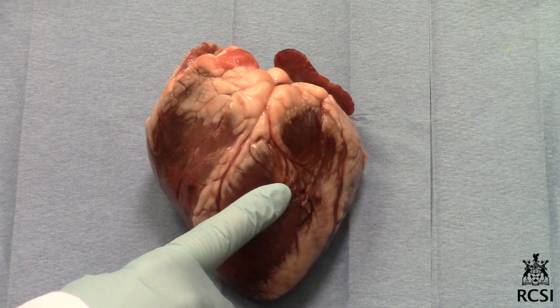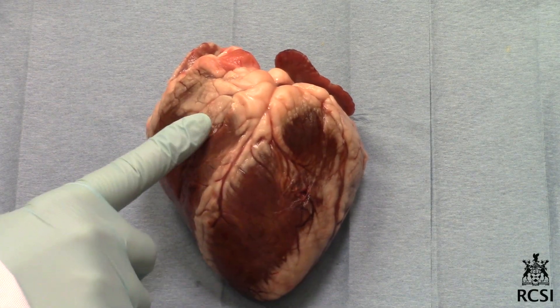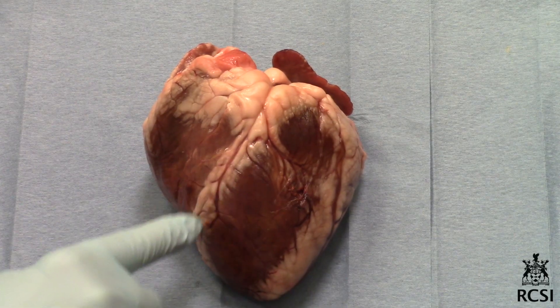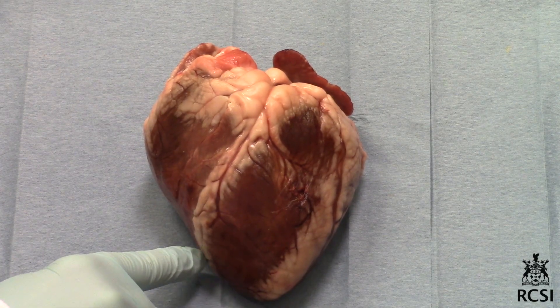Feel the walls of the ventricles and observe that the left ventricle is larger and has thicker walls. Observe the sulcus which separates the left side and the right side.